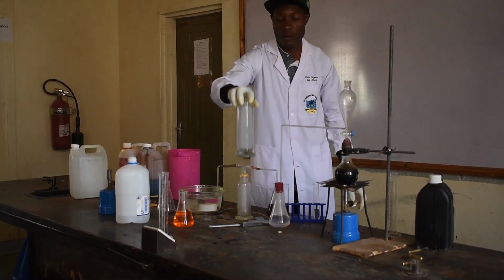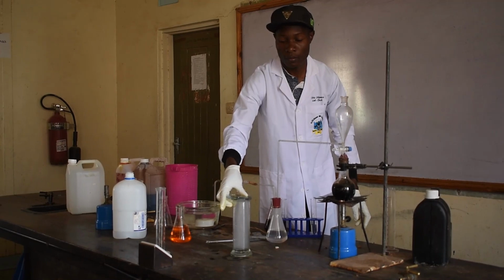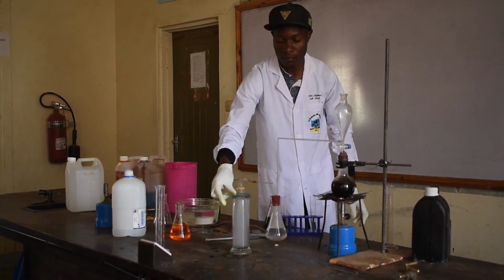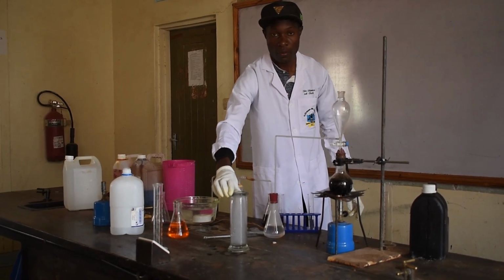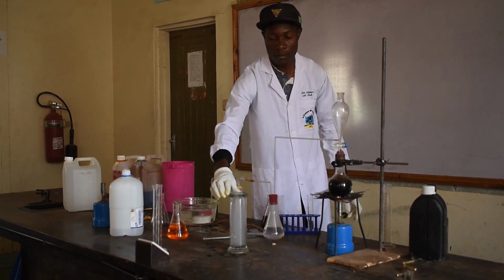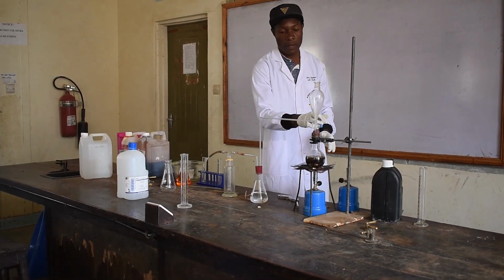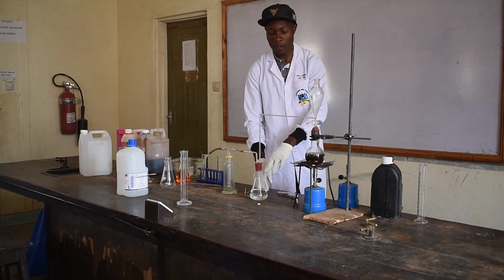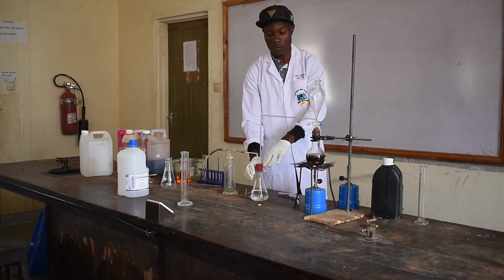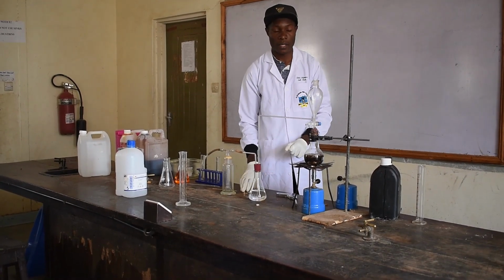Now this one is our ethene gas. It can easily escape because it is lighter than air. As you can observe here, it is escaping. The main reason why we have used a long delivery tube is just to prevent sodium hydroxide from going in the backward direction.